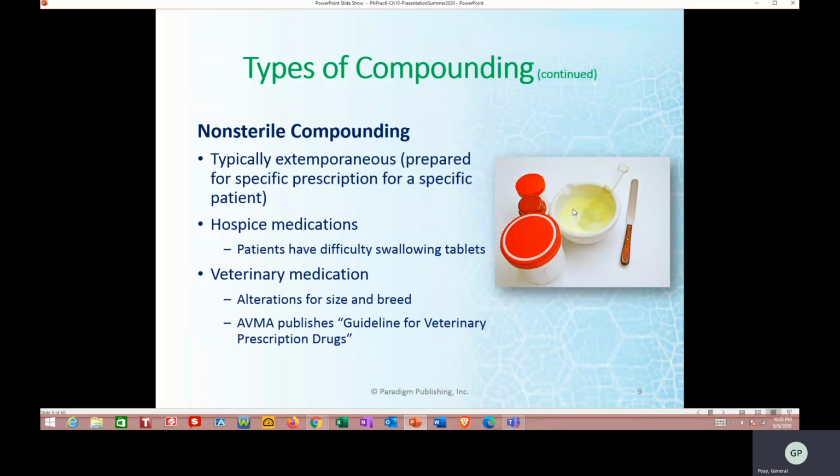Just think of that as your mortar, and they will actually grind the leaves together to break it down. It's the same technique, and this is still used today. Technology has not replaced the mortar and pestle. You will find this at any pharmacy. There are some machines that can grind tablets, but to be honest with you, most pharmacists and most techs still like to use the old mortar and pestle.